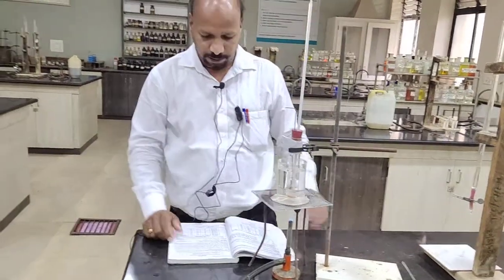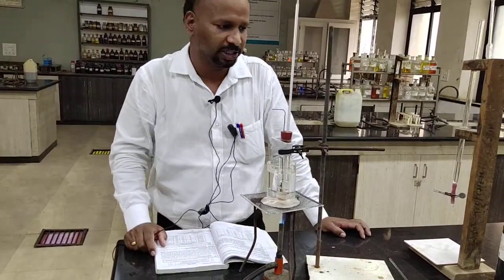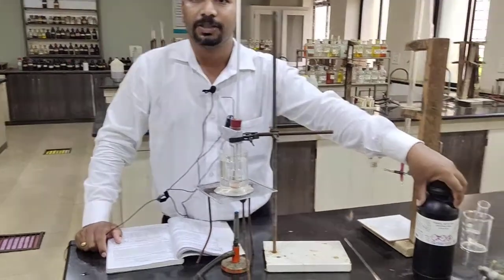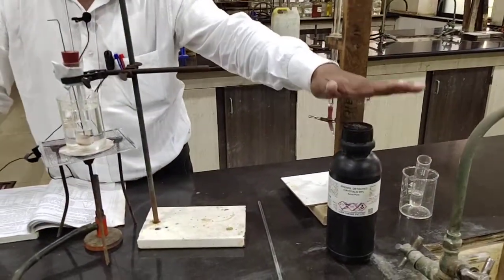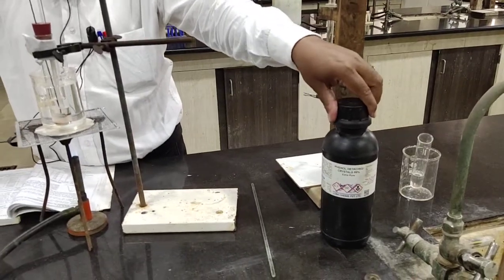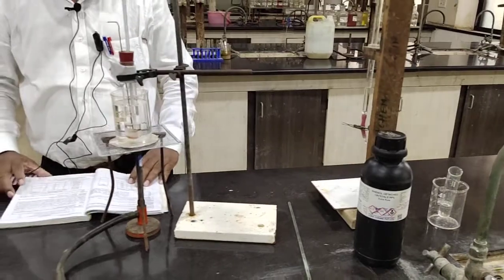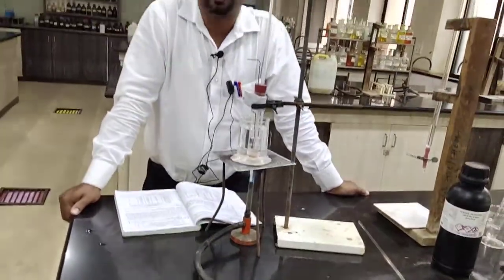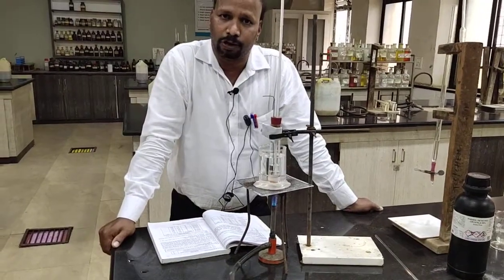First of all we have to see what chemicals are required. Since this is the phenol water system, it requires phenol, which mostly occurs in the solid state at room temperature, and then water. While using phenol we have to take care, because phenol is highly corrosive to skin.